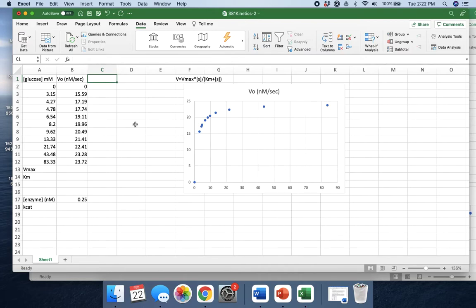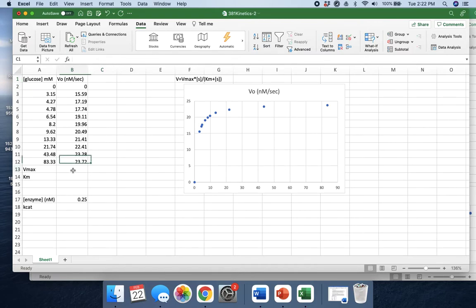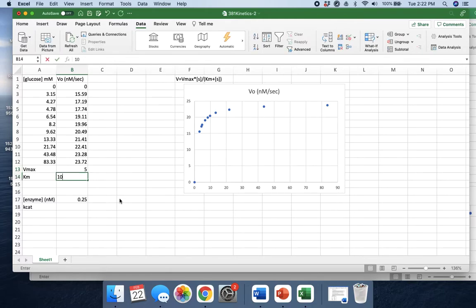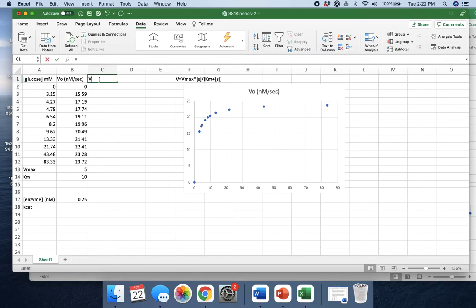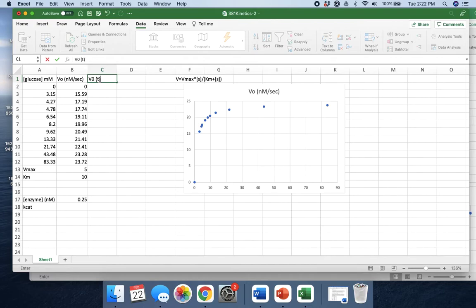Next, I'm going to show you how to use the solver. The first thing we do is we need to put in arbitrary values for Vmax and Km. We're going to have the solver optimize these values later. For now, we'll just put in maybe like 5 and 10. Then we will use these arbitrary values that will be optimized later to solve for our theoretical V0. Maybe I'll put V0T for theoretical, because this is our V0 actual.